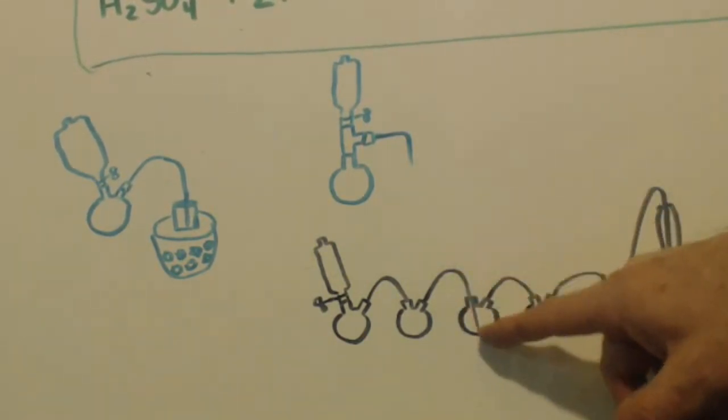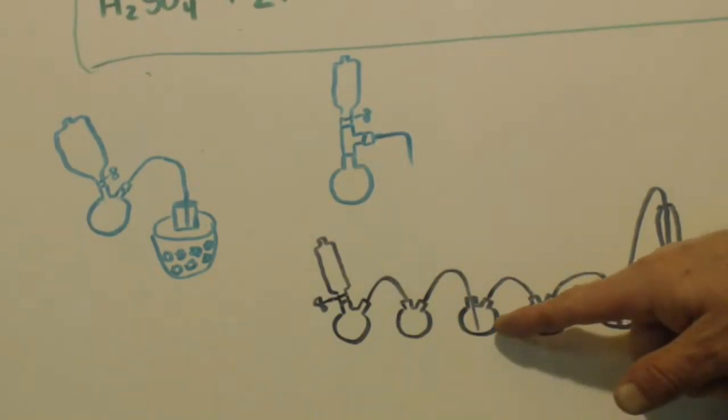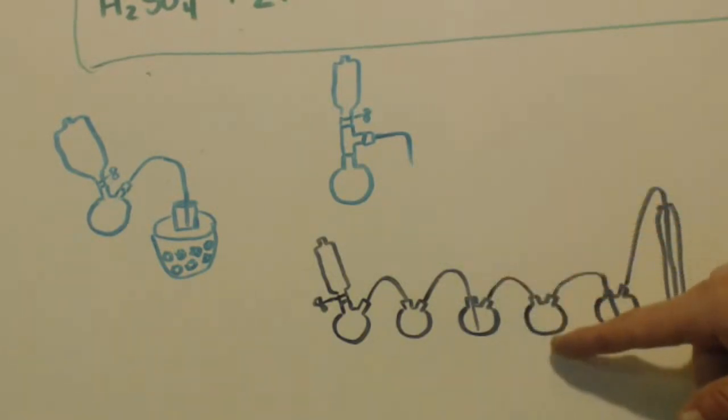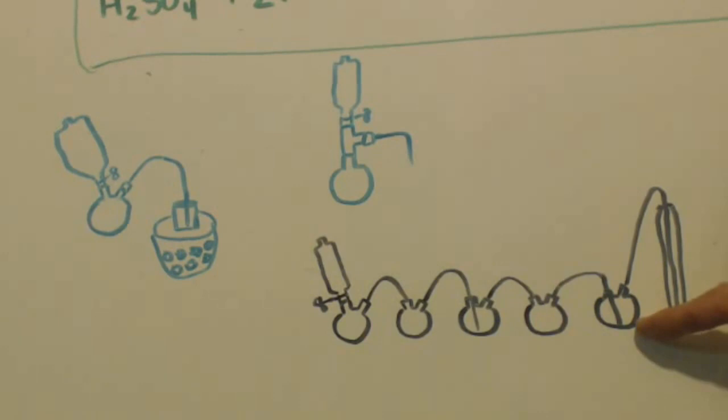It'll bubble the HCl into the water, but not all of it's going to stay in there, right? And you'd have your ice bath on here, right? And then your escaped gases can come out this hose, go into here, and again, this is empty. This is just like a part of the hose. Just think of it as a fat part of the hose. It comes through here, and I'm going to have sodium hydroxide in here, and it's going to get bubbled through the sodium hydroxide all the way to the bottom, so it has time to absorb it, dissolve it, before it gets out of there. So some stuff's going to even get past there.